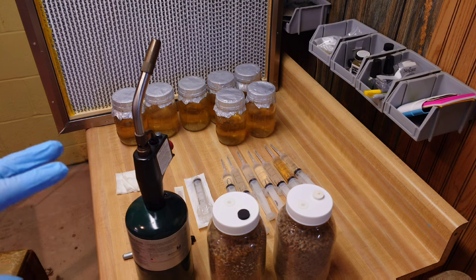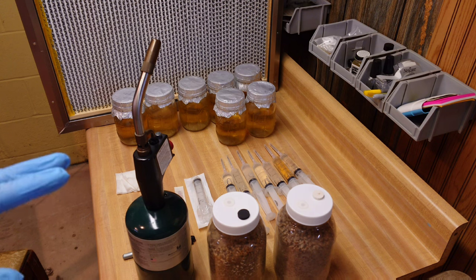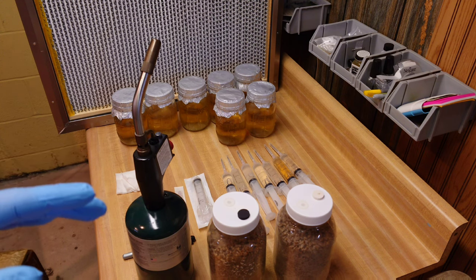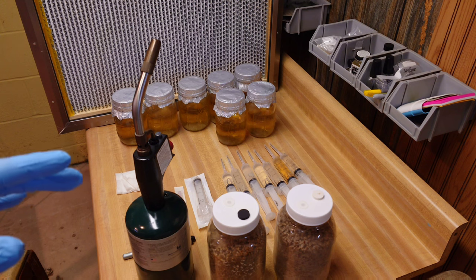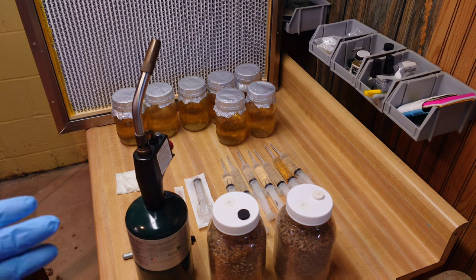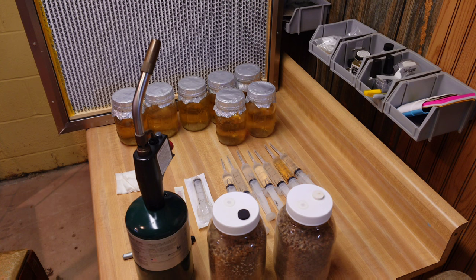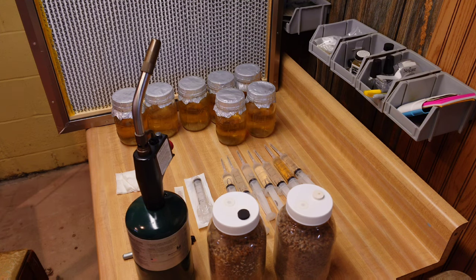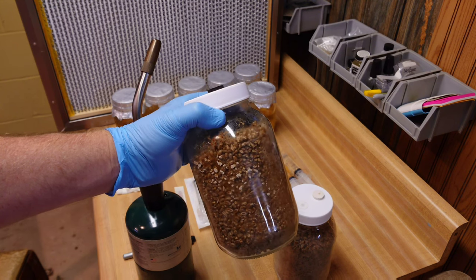I have seven jars on the table right now, holding one back to show a different technique, and seven syringes pulled from my old liquid culture jars. We're just going to inject those right into the new jars and let them take off on this new LC. When you refresh, it's a good time to take inventory of your liquid culture stock — decide what cultures you want to play with next year, which ones you can let go. I've picked seven strains to inject into those seven jars.